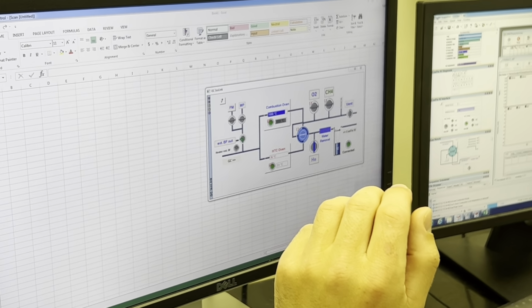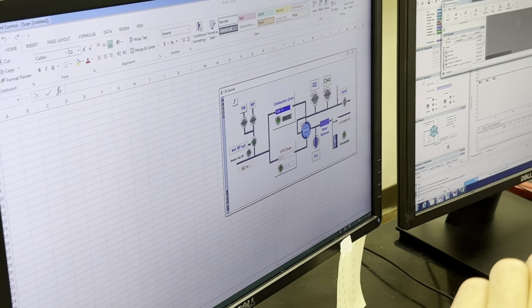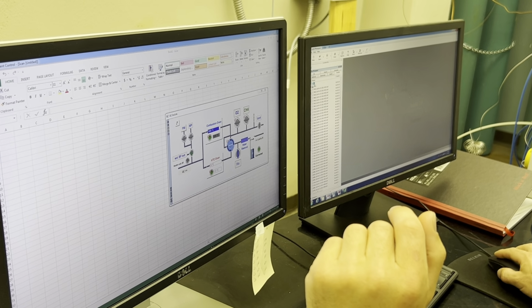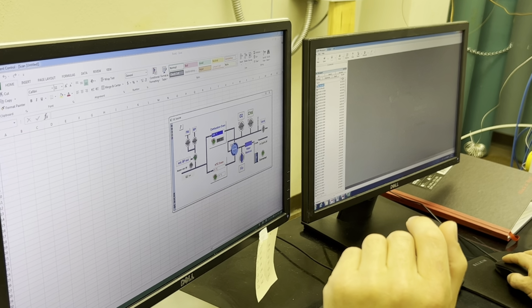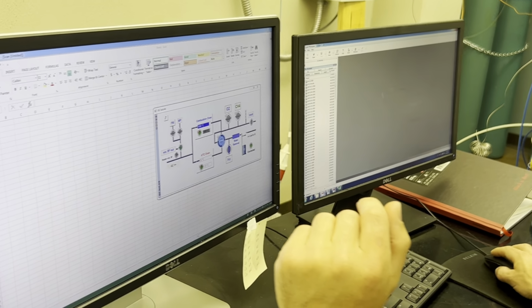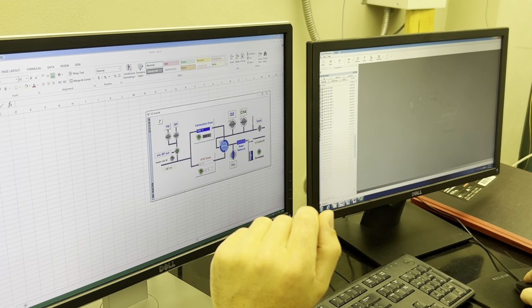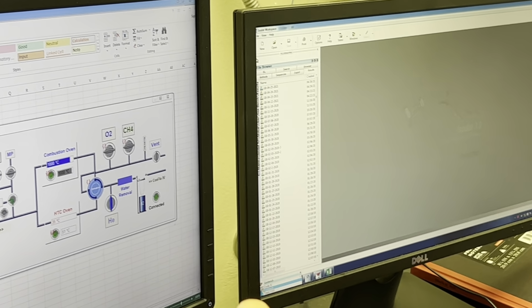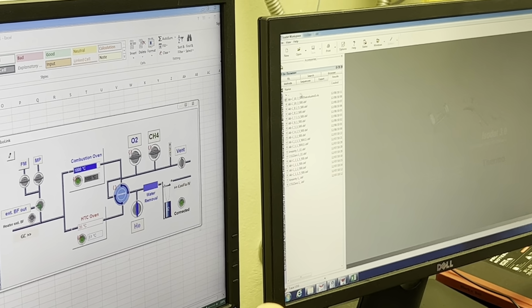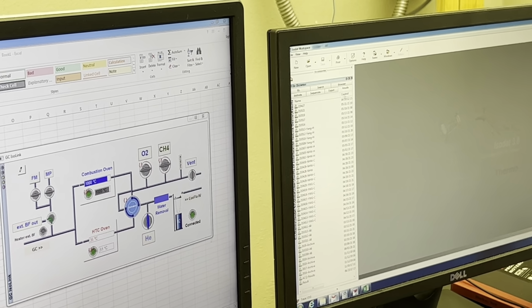We just finished the one. Next one, we go to result and check out. The copy, you just right click on it, on that column. Where are the results? Where's the two dots? Oh, this is a gas bench. Oh, that's why. Okay. There we go. 22. Yes.